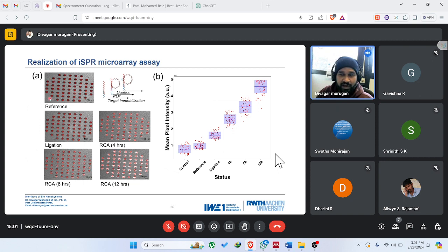The wells have to be at that particular position, there should not be a change in the position, and the contrast of the background should be uniform. All these things I have to take care of when I do machine learning. However, for deep learning, this is not a concern. I can just randomly take a lot of images like this at different contrast, at different well sizes, and the deep learning can perform the function.